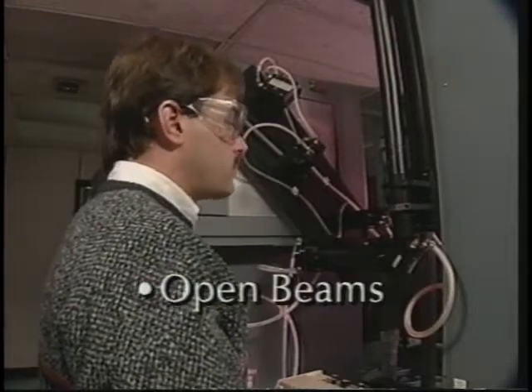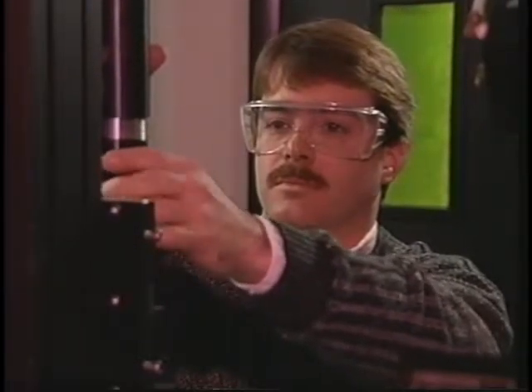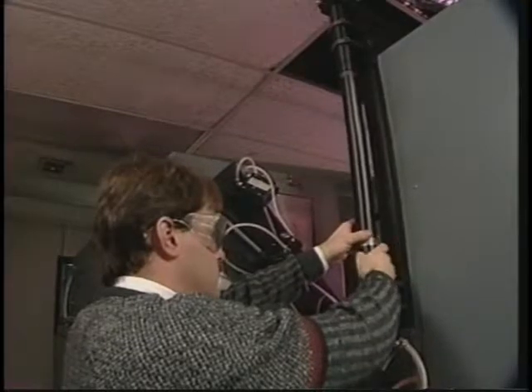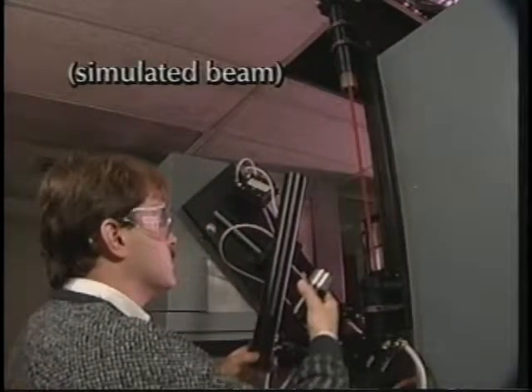Open beams most often occur when a beam housing is removed. A housing may be removed for a number of reasons: maintenance, service, power measurement, or aligning of mirrors. An open beam from a Class 4 laser may cause a hazardous reflection to project across the entire length or width of a room.